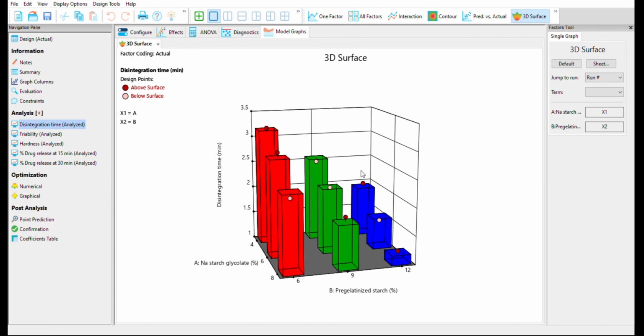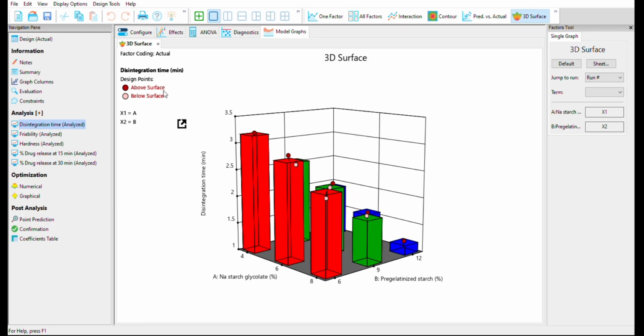Okay. Just click on copy and use the custom data and click on OK. So it has been copied. If you go to Microsoft Word, you can easily paste it there. Just right click. You can also export this. Okay, I would suggest you copy this, or click on export as bitmap. If you export as bitmap, then you can easily copy and paste this.